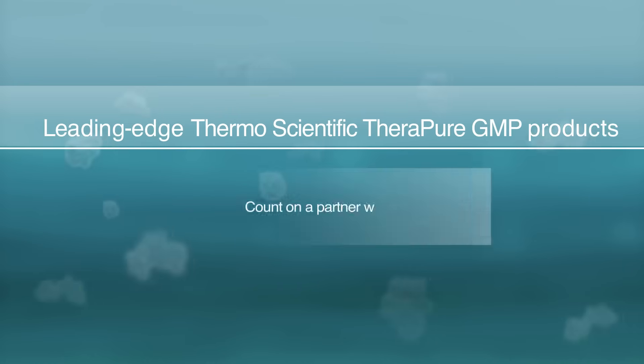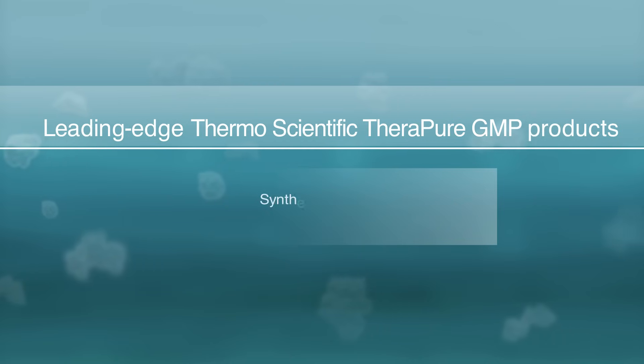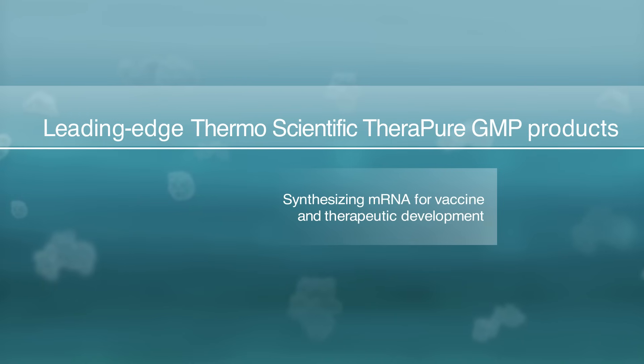mRNA synthesis. In this video, we will describe the process of in vitro transcription and show how TheraPure GMP products have been used in synthesizing mRNA on a global scale for vaccine and therapeutic development.